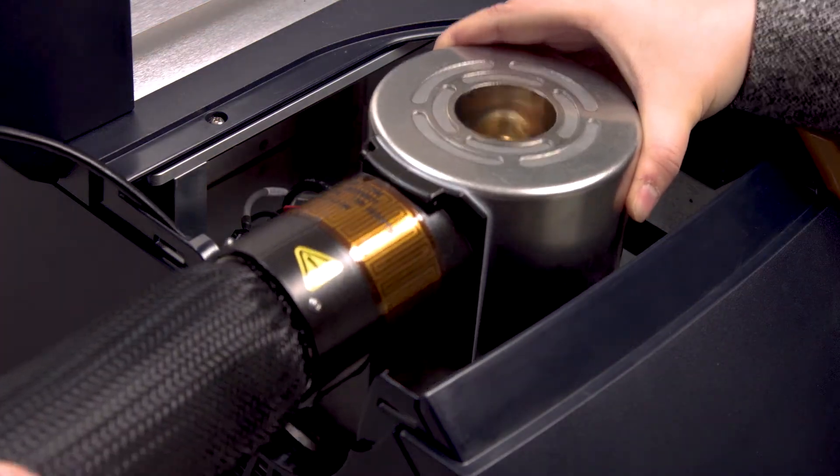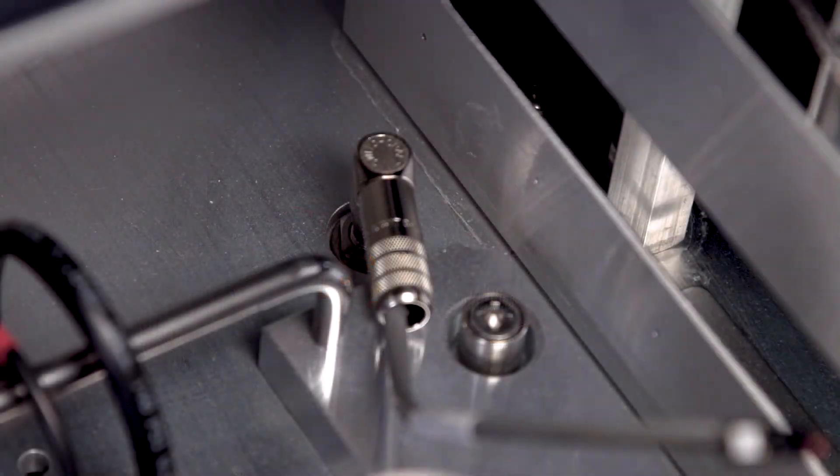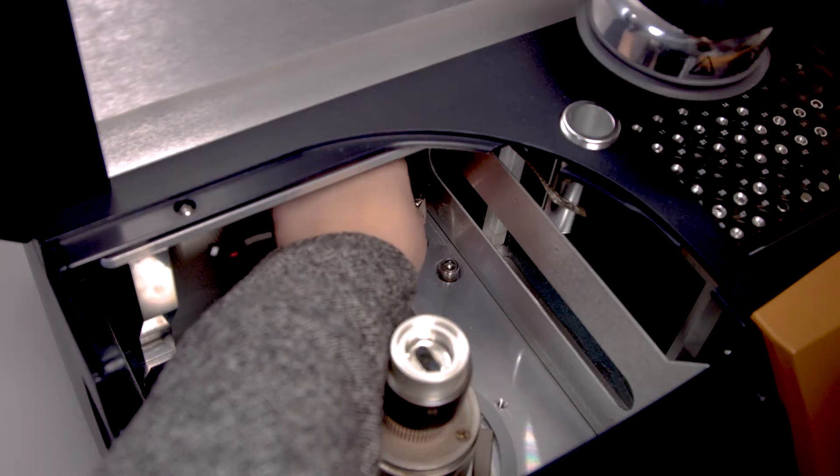Gently hold the cooling head and remove it from the DSC. Unplug the heater cable.